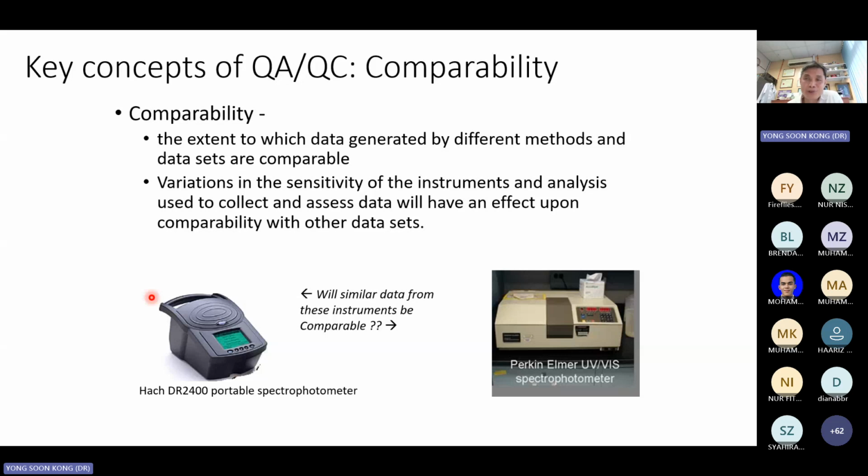Do you know that the photometer that you have used before sebenarnya dah tak accurate tau? Korang tahu tak? Tahu, Puan Yus bagi tahu. Okay, so itulah. Our portable photometer dah tak accurate. Sebab tu, we are not bringing this. Oh, by the way, this actually, you can bring to the site tau. And you actually can determine whatever that you want to determine using this photometer. It is portable sebenarnya. So you can bring to field trip if you can.